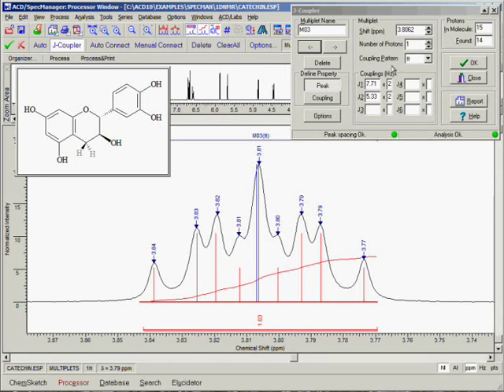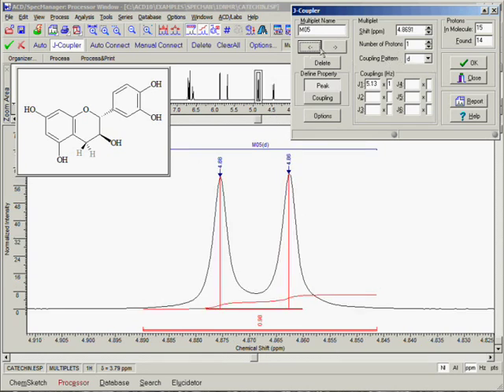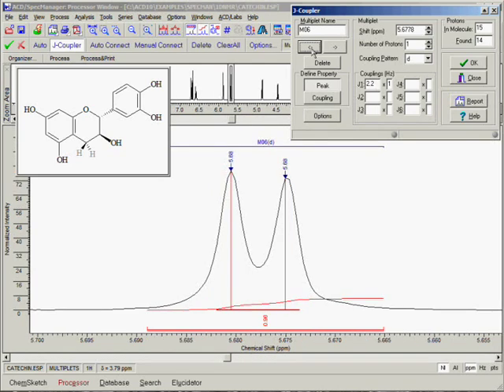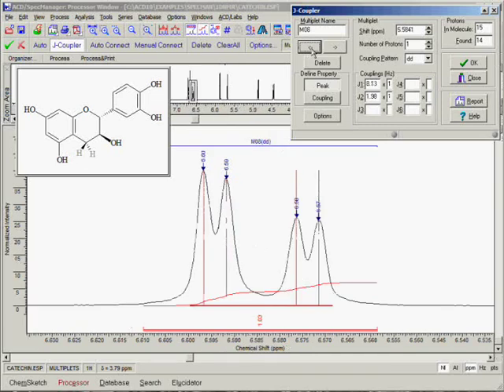Now we can stroll through the rest of the multiplets that have been created, taking care to ensure that the coupling patterns and number of protons assigned to the multiplets are correct. We are also being careful not to identify any impurity or solvent peak as a multiplet. If we are satisfied that all of the multiplet information is correct, then it's time to prepare this multiplet information into journal report format.